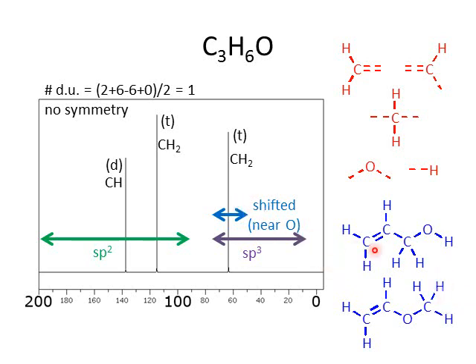The sp3 hybridized is definitely by oxygen in both. We might make some conclusions about this carbon, but that's a little bit unclear. A CC double bond with an oxygen next door, this one's shifted. It's not shifted all the way over here, but maybe I'm not going to put stake on that. I'm not going to use that to solve my problem. But here, this next piece of information will help us nail it down. A CH, a CH2, and a CH2.